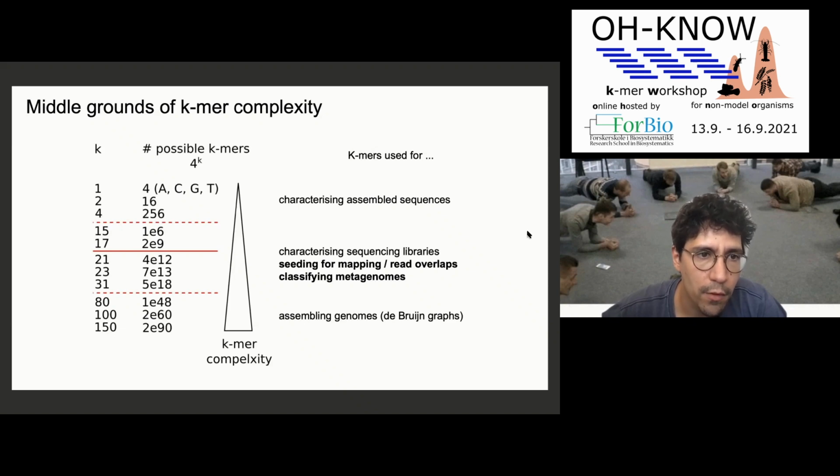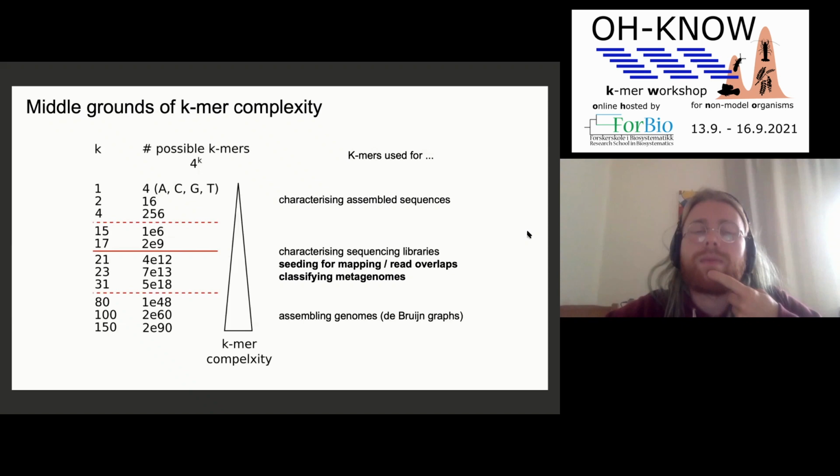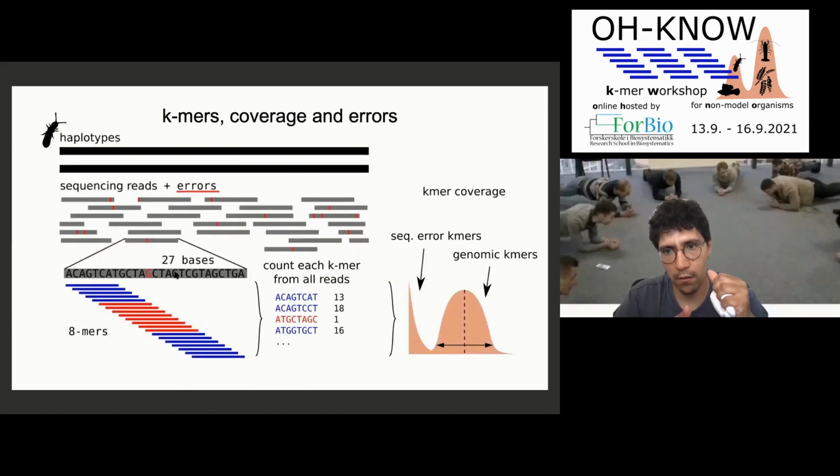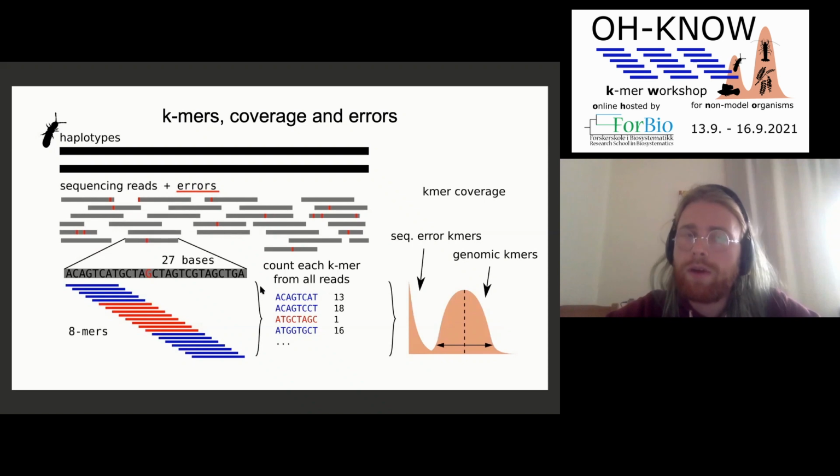This is the part I am most curious about. It is not really intuitive. How could Kmers behave like that? Why is the correct one normally distributed and the errors in the lower tail? So all this is based on the fact that the errors are rare. If the errors are not rare, then the distributions will be completely blended.